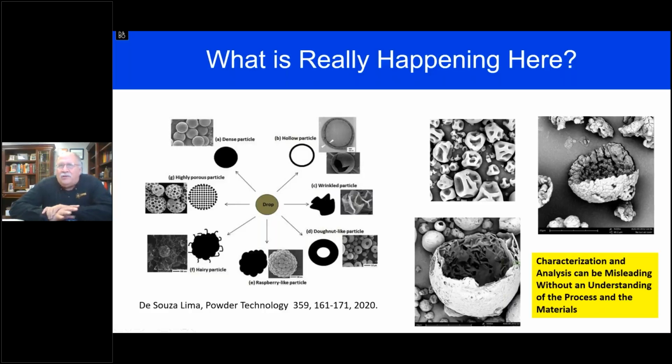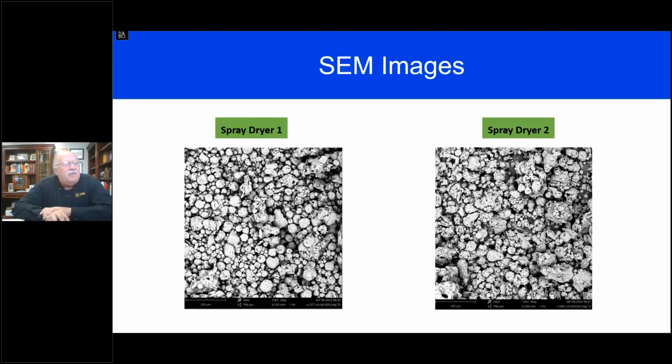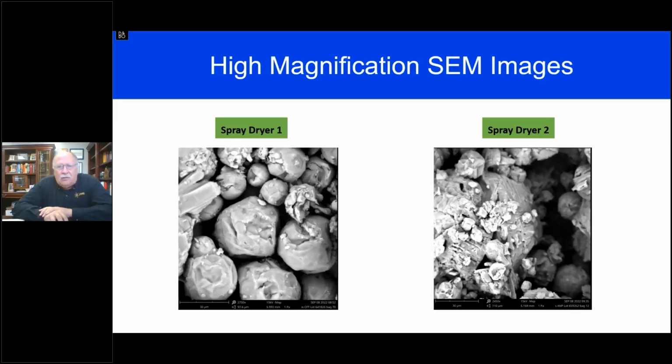So think about the analysis. The analysis that was done by the engineers and the analysts for these three examples that I showed you is absolutely dead on. These are just some examples of particles that we made to show that, yeah, we can make these types of interesting materials. But what I found very, very interesting about going back to this first example is, quite frankly, I have never seen images like this in my life. The size distribution isn't going to tell you what's going on here. The sphericity might tell you something, but when you look at these pictures, it's like, what the heck is going on here?